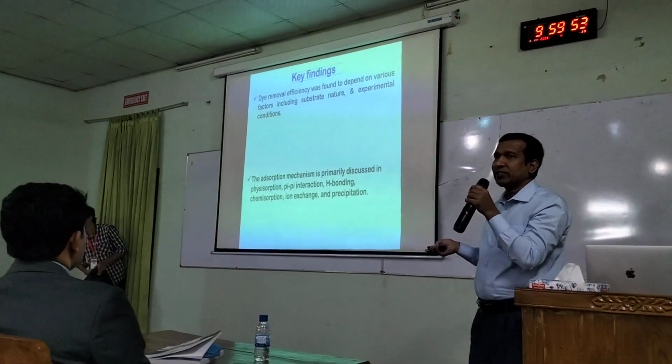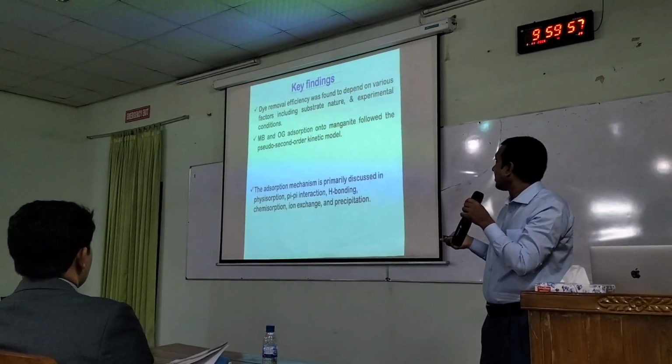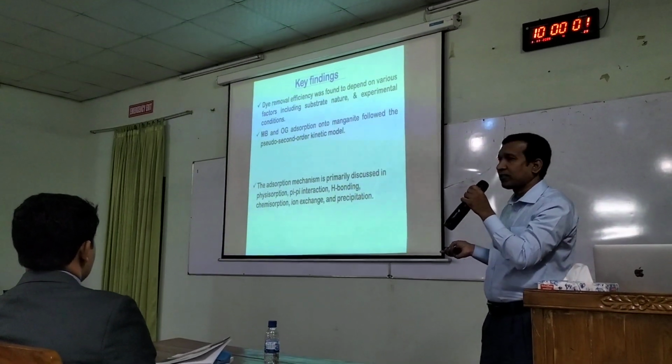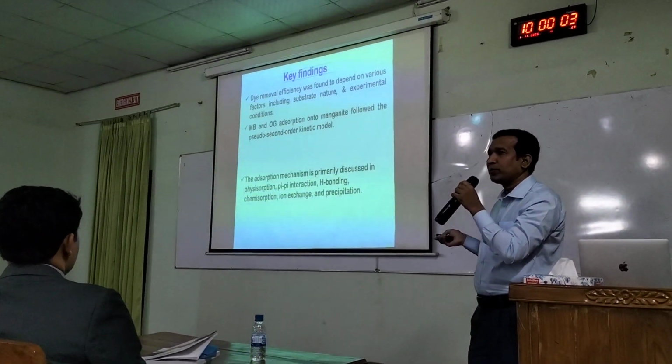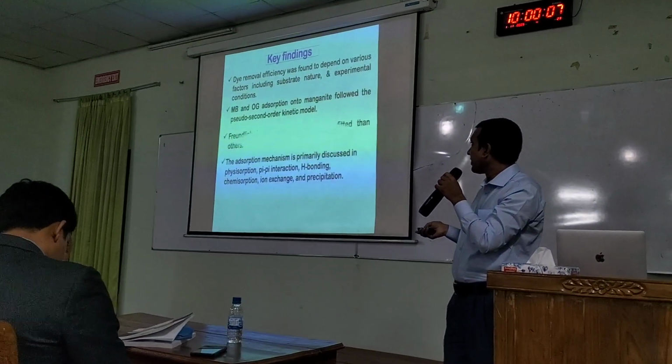So, from this study, the key findings are: dye removal efficiency was found to depend on various factors, including the nature of the substrate and experimental conditions.